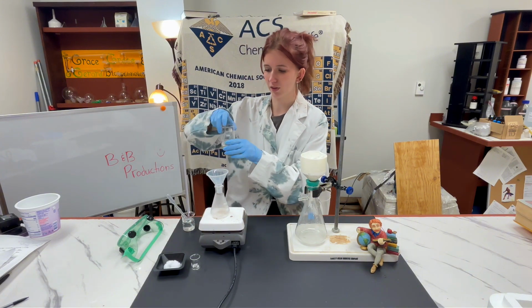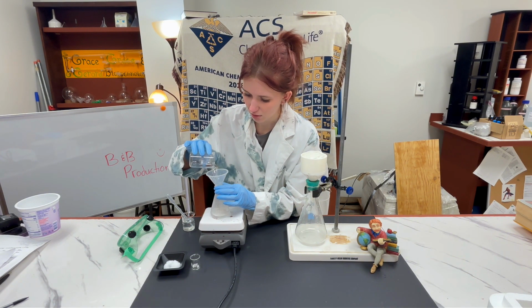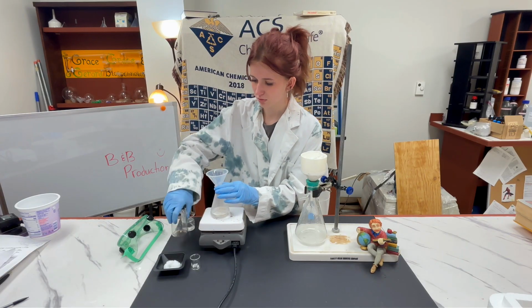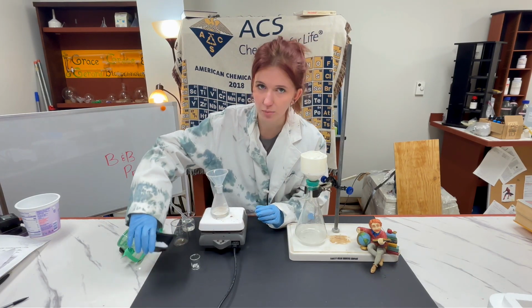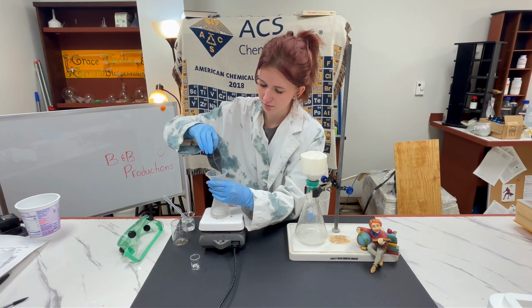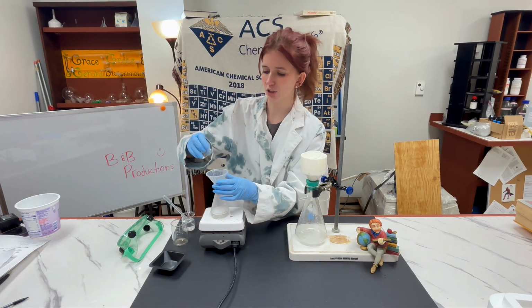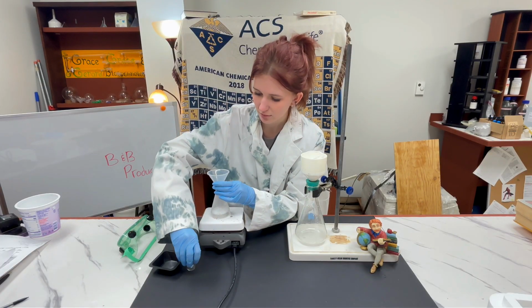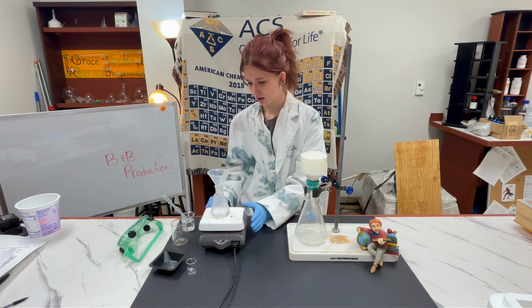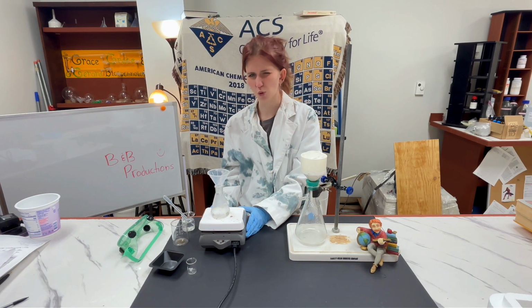So I'm going to add the water, benzoic acid, and I'm using 2 boiling chips. I'm turning my hot plate on to about 4 or 5.